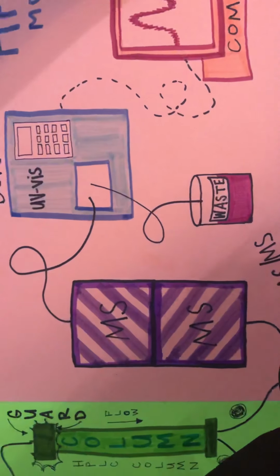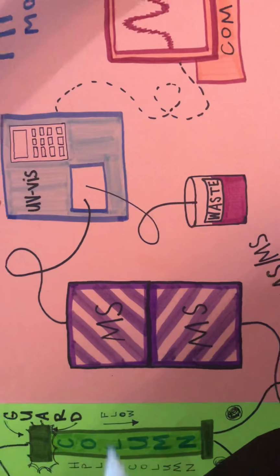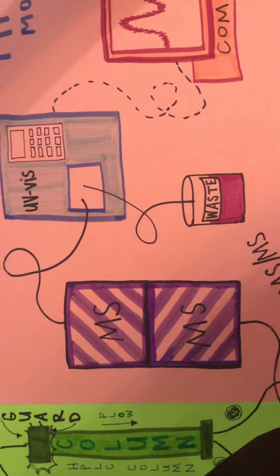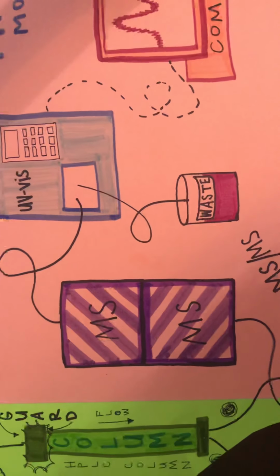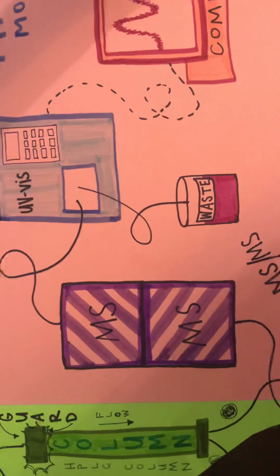The detector can then analyze the molecules passing through it either non-selectively or selectively. So we could choose a wavelength that we think is relevant for the UV vis detector to emit, and the detector will tell you what compounds pass through the light after the compounds have been separated.